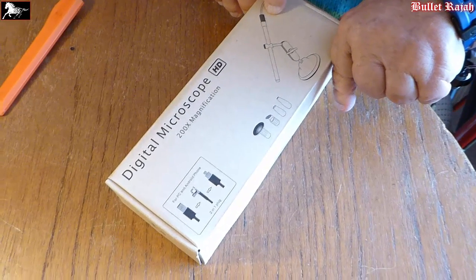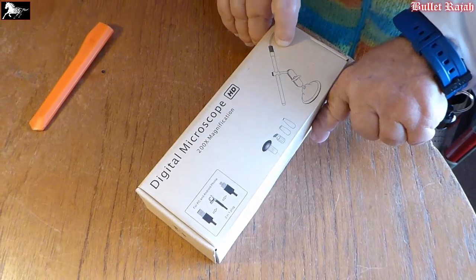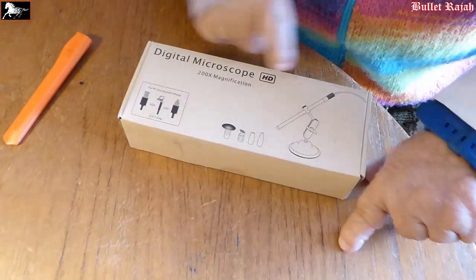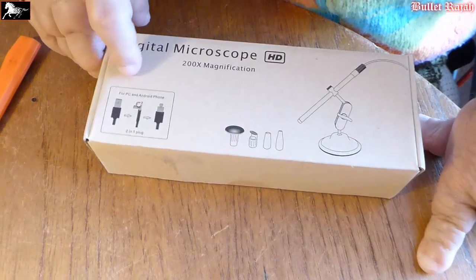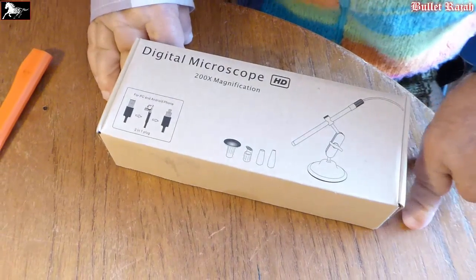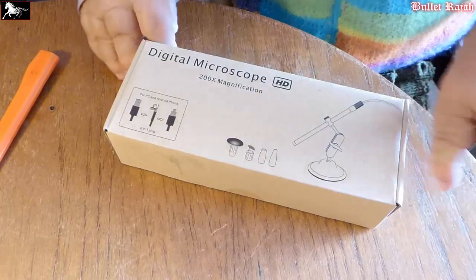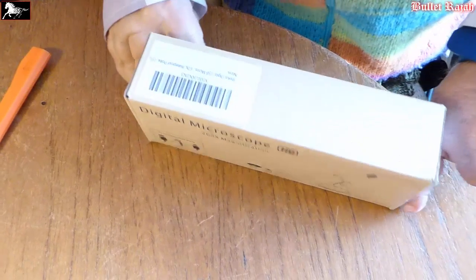I've just got this digital microscope for Android and PC, and here are all the various attachments that go with it, such as a USB thing which can be flipped over to fit an Android phone, and also there are various attachments here, here and here, so that you can see round corners and stuff like that.